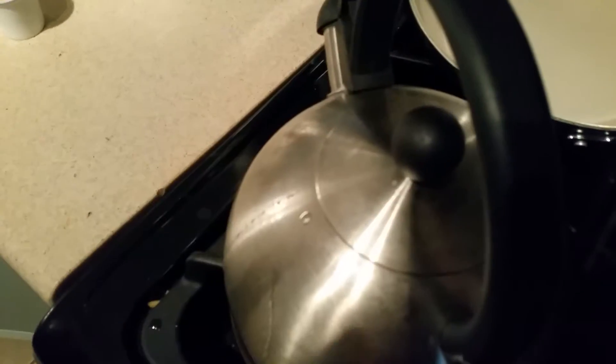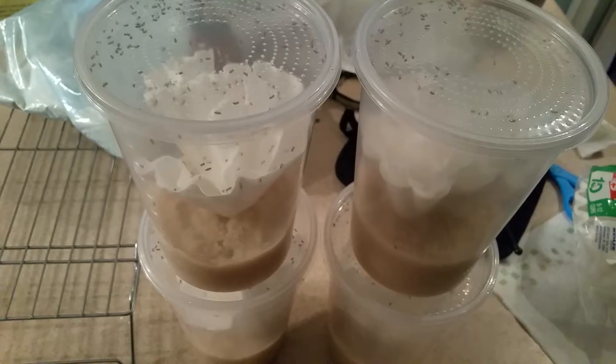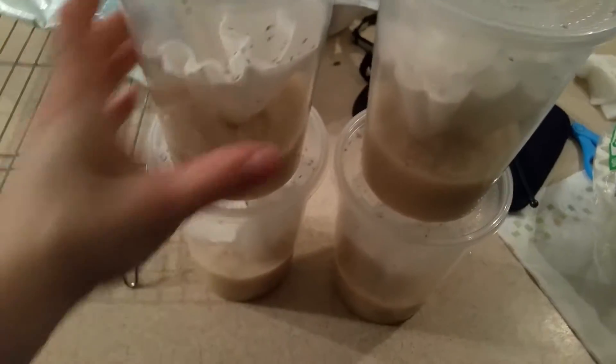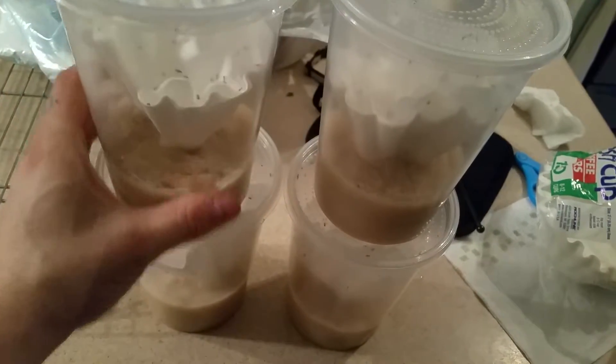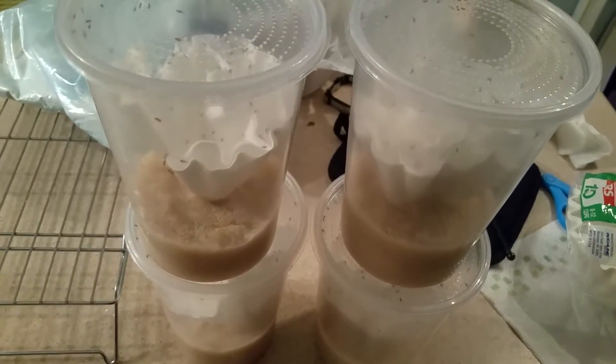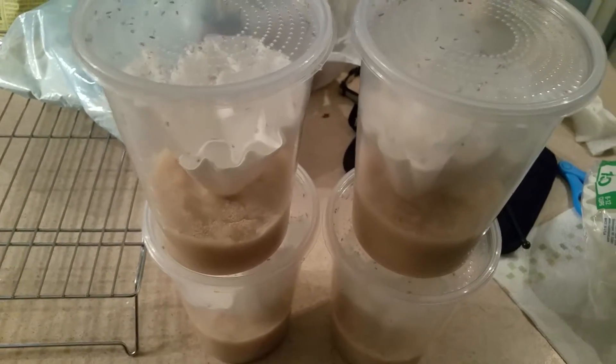I put water in a kettle and boil it until it's really boiling, then just pour it in there and mix it up. I have these little cocktail stirrers I use. Fly culturing is pretty easy. If anybody's interested in the recipe I use, I can post the link in the comments.